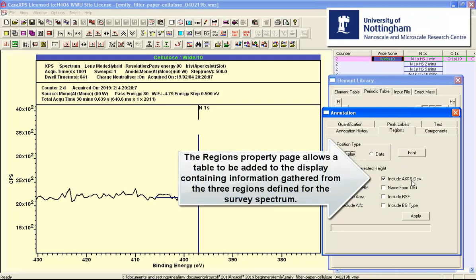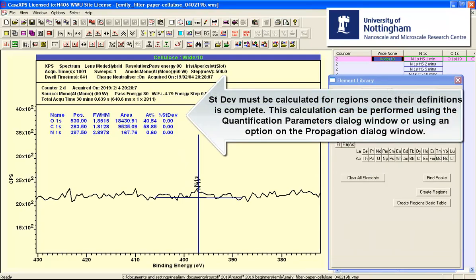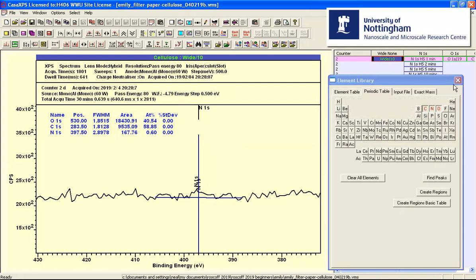So there's the region and there's the percent standard deviation and they're all set to zero because the calculation has not been performed as yet.